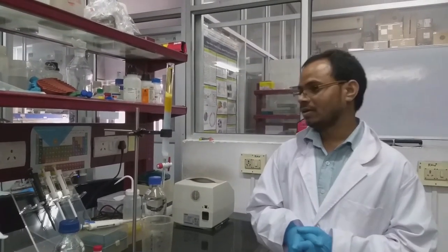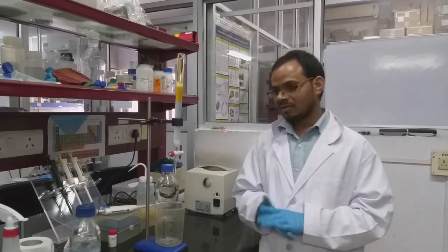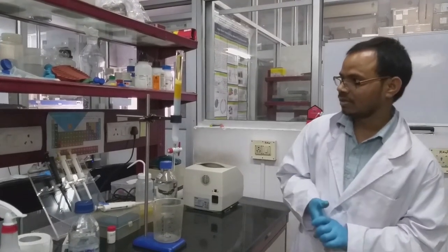With this, we understand that gel filtration chromatography is a very advantageous technique for separation of proteins, peptides, and oligonucleotides. Also, during this experiment, we have to remember a few more points and follow them cautiously.